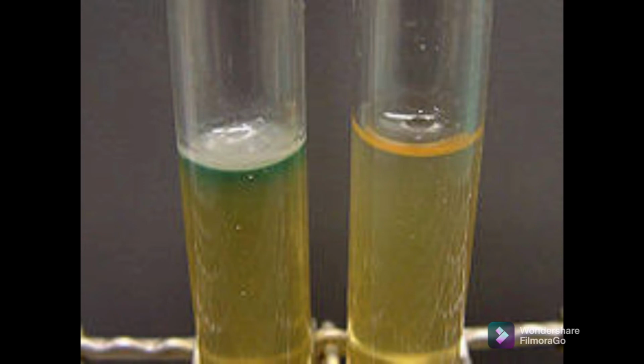The colony mass tapered gradually from the outer edge of this ring to an irregular translucent form. It is found to be filiform, uniform along the line of inoculation. Odor, absent or resembling. In an ordinary medium like nutrient agar medium, Pseudomonas aeruginosa produces a characteristic sweetish odor or a distinct musty or earthy smell in the medium.